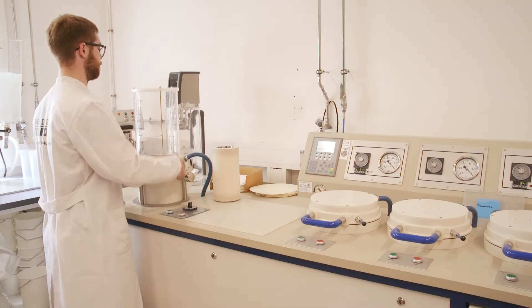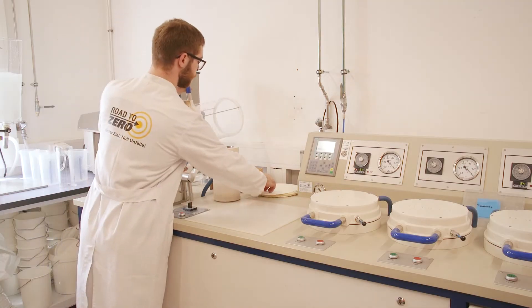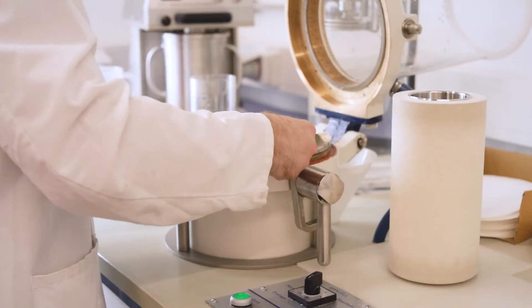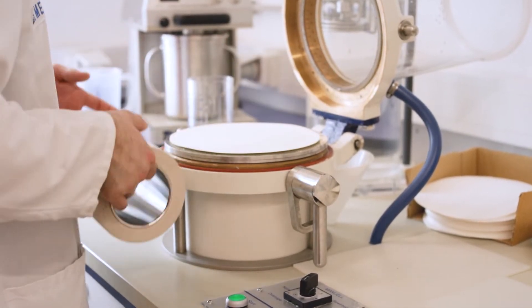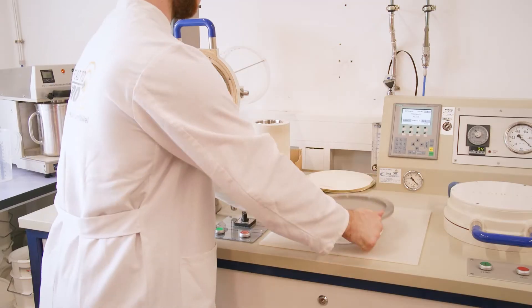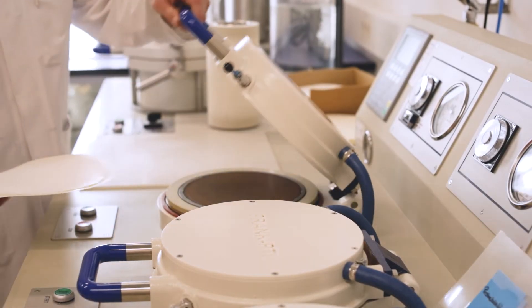The formation of the laboratory sheets. The optical and physical properties of these sheets are later tested.